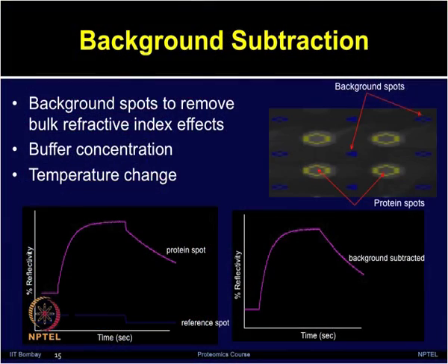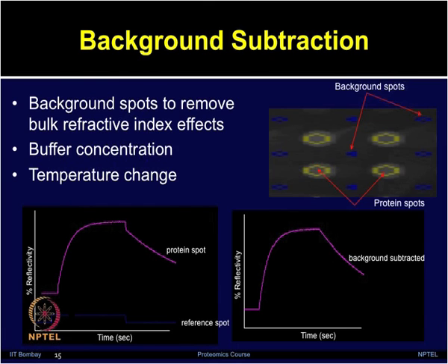The SPR image generated from the CCD camera allows software to add spots on the background surface. Each ROI or region of interest can be defined for measurement. Surrounding each spot, four background spots are generated which can be used for background subtraction with the protein or biomolecule which is printed. Background spots remove the bulk refractive index effects. The protein spot signal and the reference spot signal are shown, with the x-axis showing time in seconds and y-axis showing percentage reflectivity. The background subtraction is shown by subtracting the reference spot signal from the protein signal.